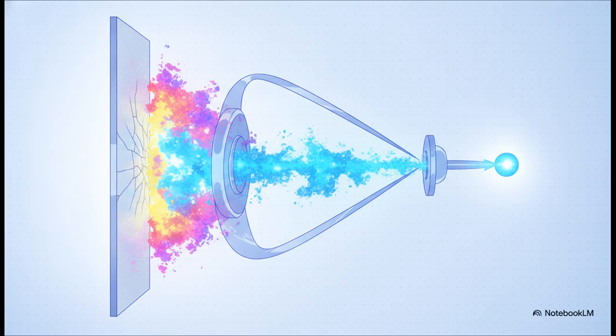Out of 1 million ions generated in the plasma, only 1 actually reaches the detector. We absolutely have to separate our target analyte ions from a massive cloud of uncharged neutral species and blinding photons, which otherwise just cause a ton of background noise. To do this, we use the ion focusing region. A series of metallic plates and cylinders apply electrostatic voltages to literally steer the charged ions of interest off-axis and safely into the mass spectrometer, while the uncharged photons and neutrals just crash harmlessly into a physical barrier.